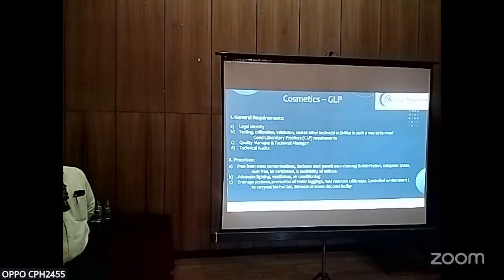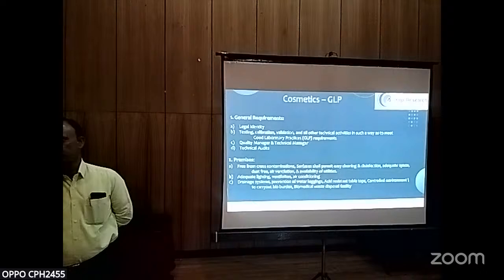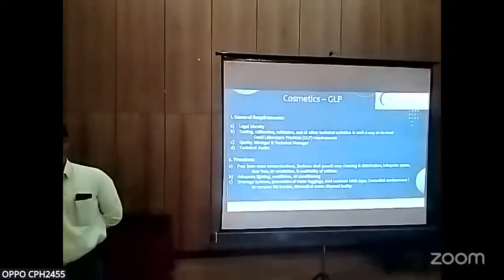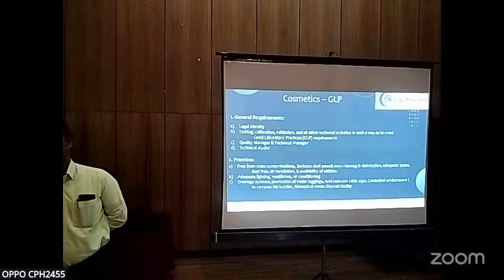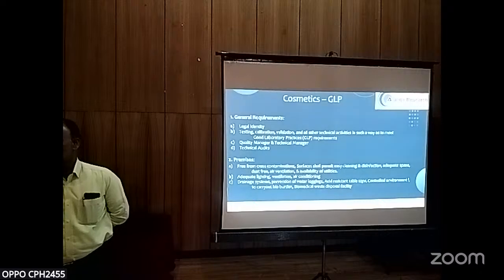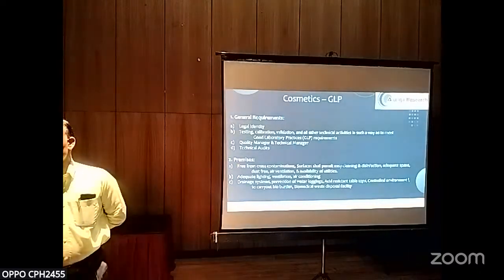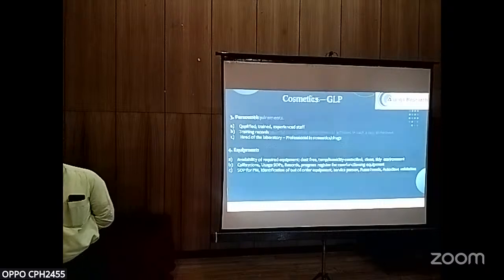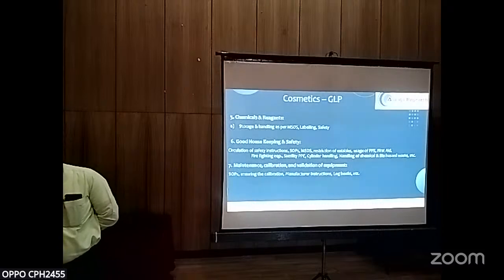Then to perform all these tests, a few rules I have to follow. We have to follow the laboratory general requirements. The analyst or a person legally identified should be qualified under qualification and be a qualified person. They should be recruited. And testing, calibration, validation, and all other technical activities should be carried out in such a way as to meet the GLP requirement. Quality managers and technical managers have to evaluate the technical audits and requirements.